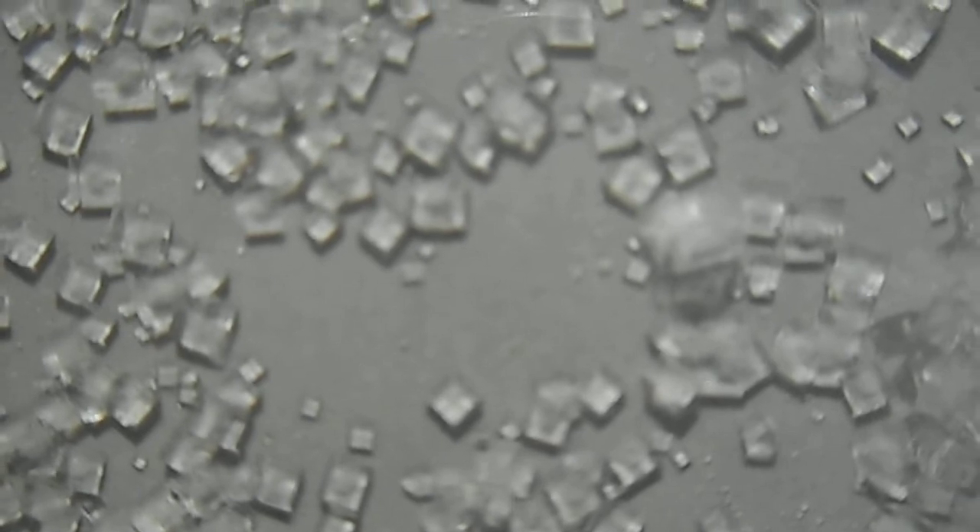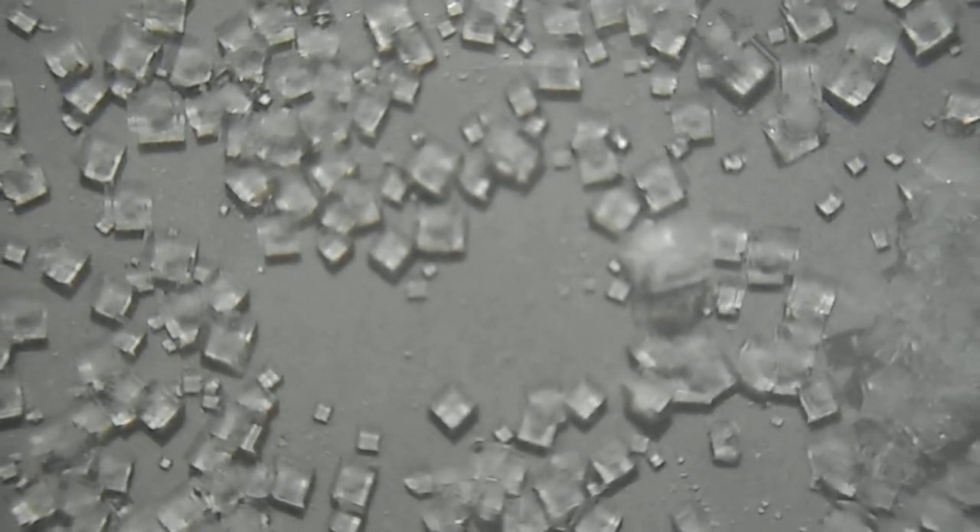These are the sea salt crystals. Re-crystallization of sodium chloride.